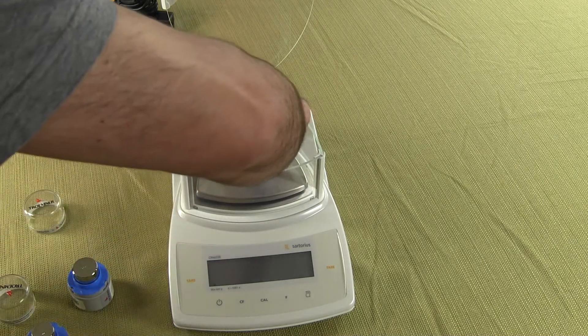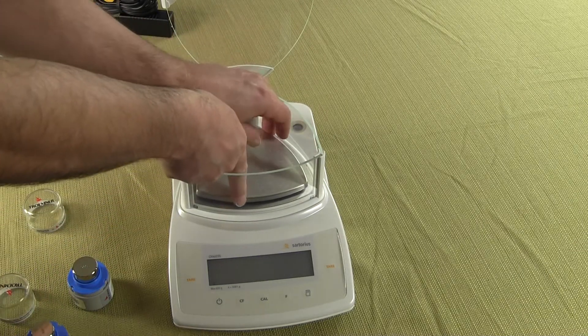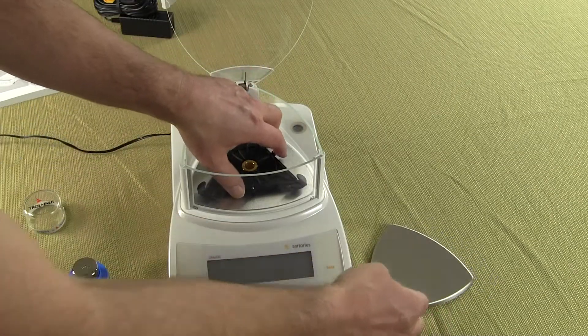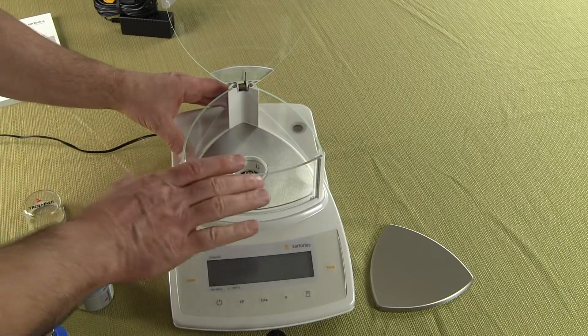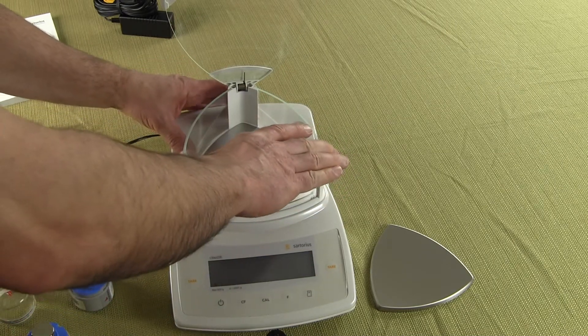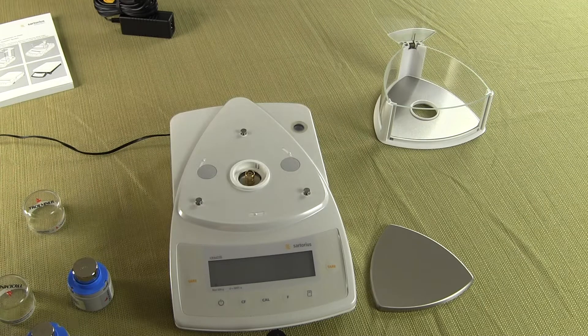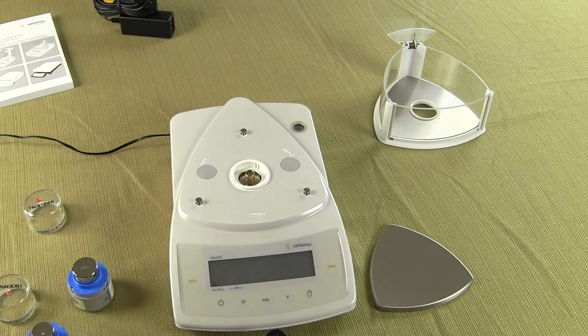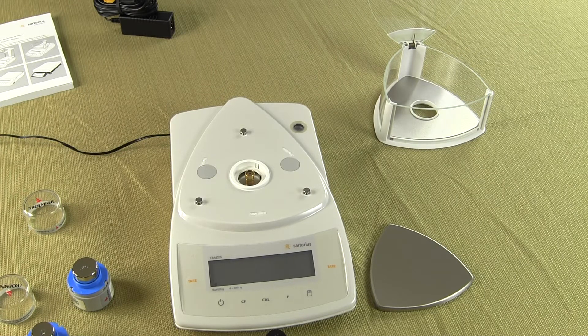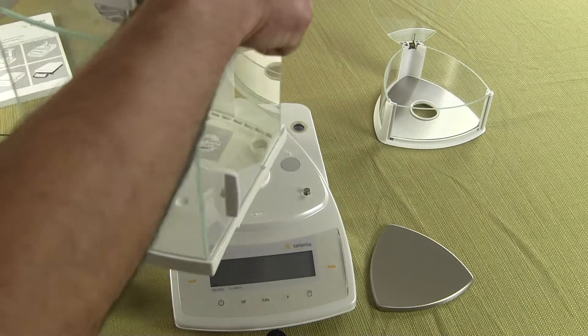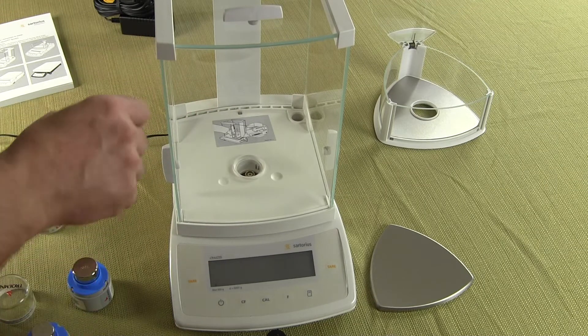So I want to show you the optional glass draft shield that's available on this balance. So I need to take off the weigh pan and support pan. And again to take this off, this draft shield I'm just going to twist, come straight off and over. Now sometimes people might want to do density determination and if so on the milligram balances you would have to buy, or it's highly recommended that you buy the optional square draft shield.